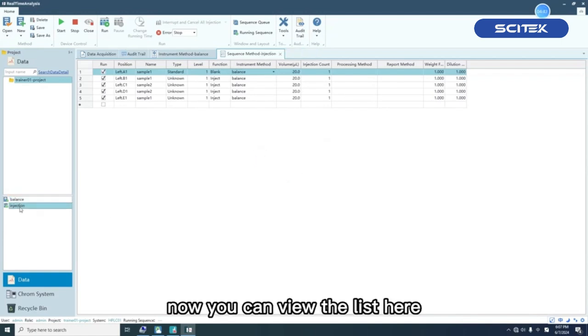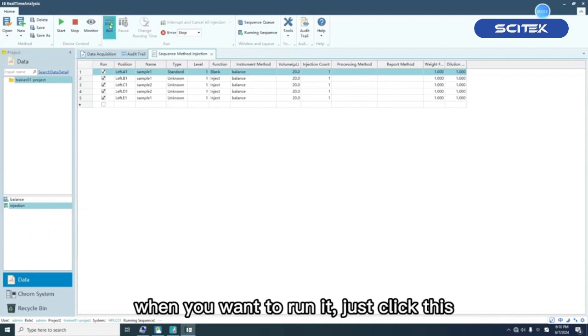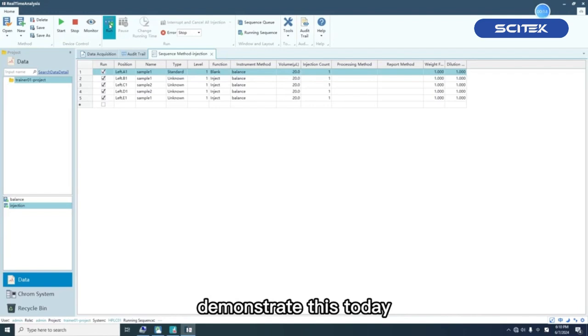Now you can view the list here. When you want to run it, just click this to run the sequence. Due to the time constraint, I'm not going to demonstrate this today, so we'll move on to the next part.